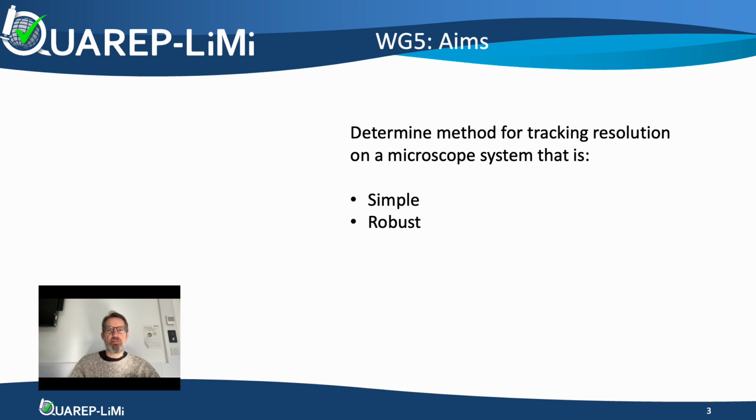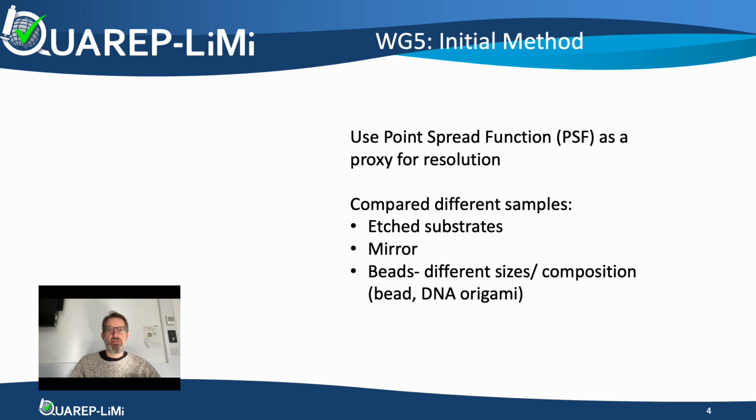We are estimating resolution by looking at the resolved size of a diffraction-limited spot, known as a point spread function, or PSF. This can be monitored on the same microscope over time, helping the user identify any potential problems. This does not mean a minimum resolving distance of two objects, but it is still a reliable and consistent measurement of the resolving power of a microscope.